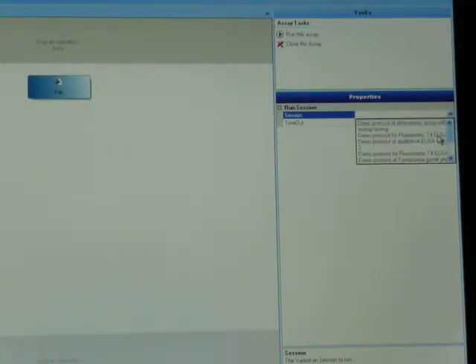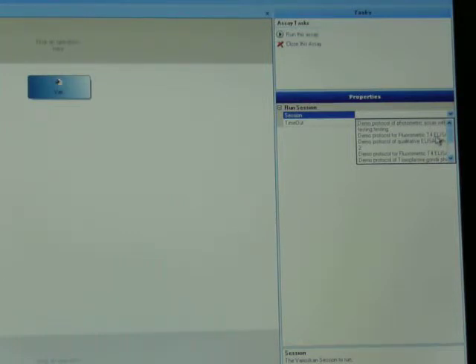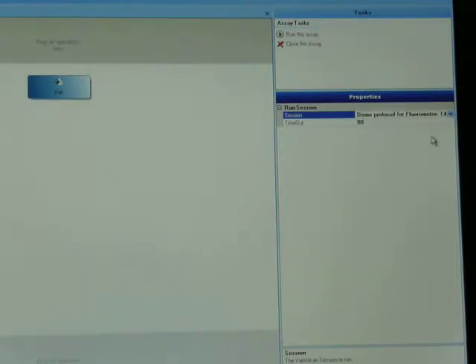What you can see is I've pulled through all the protocols that are stored within the VarioScan and the Scanit software. I'm just going to pull through an ELISA demo protocol.